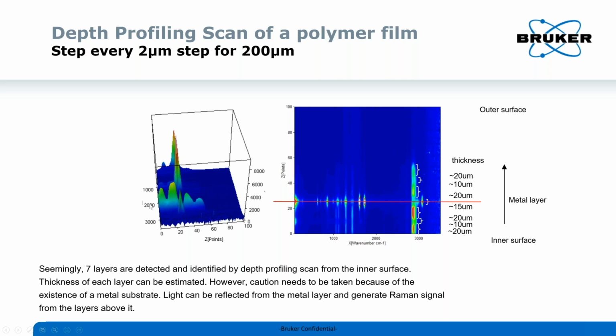So what's nice about this is now we're going to march through by bringing the sample up and doing Raman. And we're actually not going to microtome it. We're not going to mount it up or anything else. We're going to leave it flat on the microscope and just bring it up through the field of focus and then continue to bring it up. And lo and behold, what we see is that we can see the principal layers shown here on the left, and then we reflect off the backing and then can see the other layers, these same layers come back into focus having bounced off.